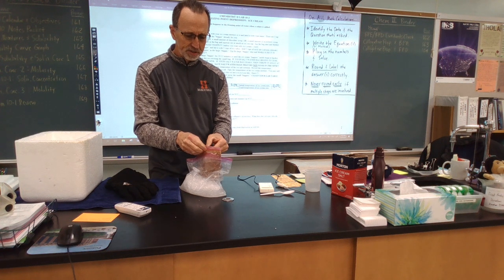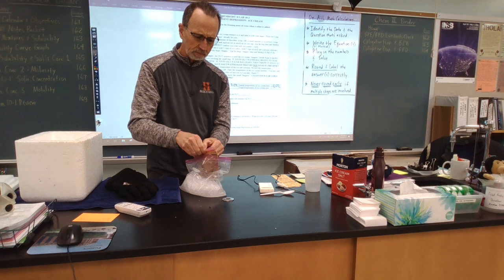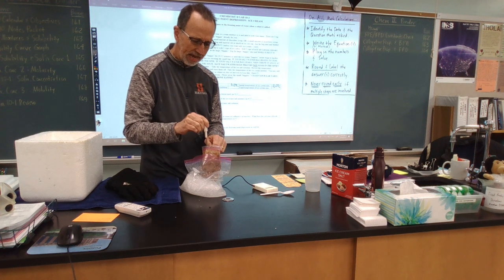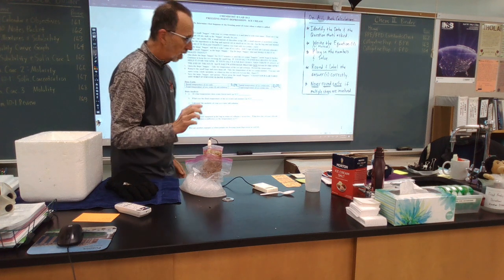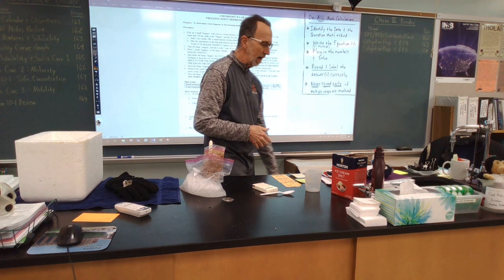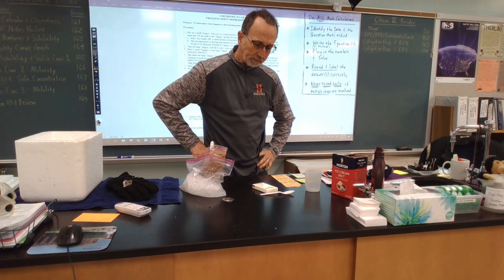All right, so first things first, got a couple pieces of data I want to take here. First is the temperature of the ice cream itself. Remember, ice cream freezes at about -2. I'm going to assume it's a little bit colder than that, and in fact it is.